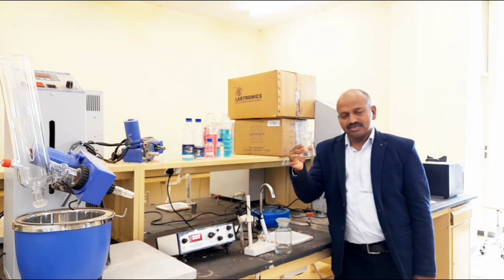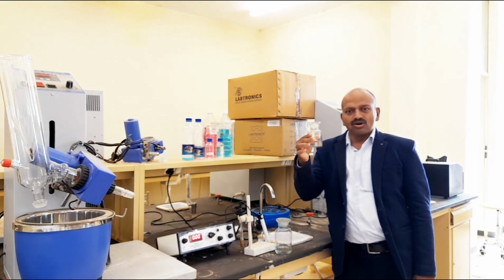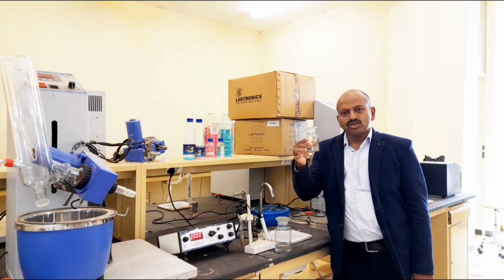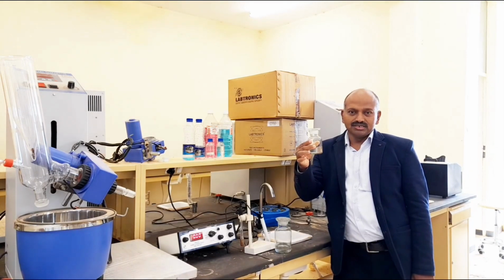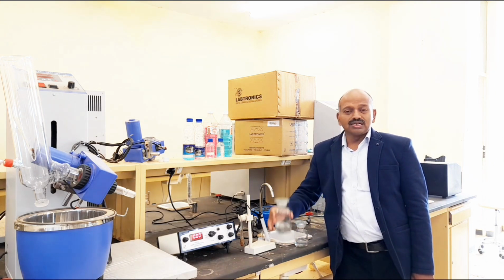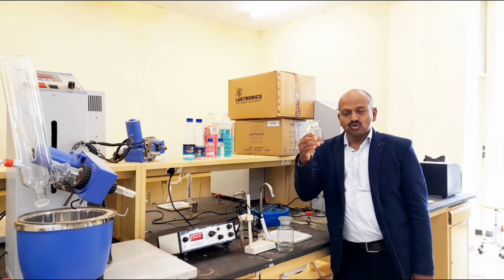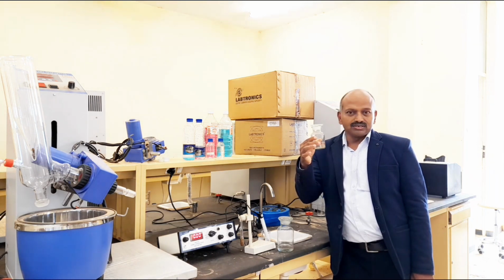In this experiment, we will find out the amount of sodium chloride and the amount of sodium hydroxide present in this mixture, and also the percentage composition of the mixture. By using the known strength of hydrochloric acid, we will find out the grams of sodium chloride and sodium hydroxide from this.